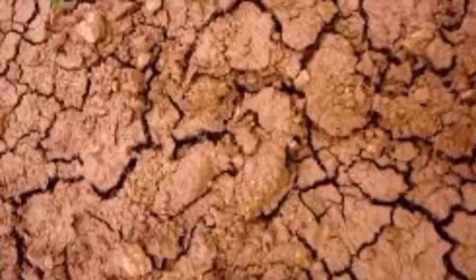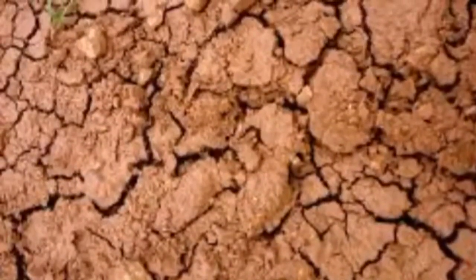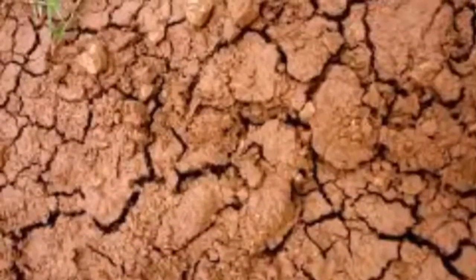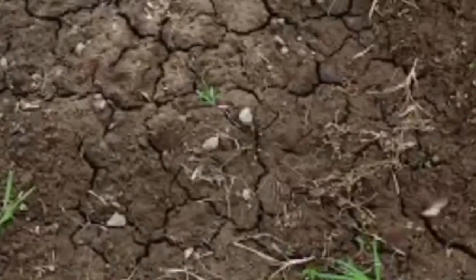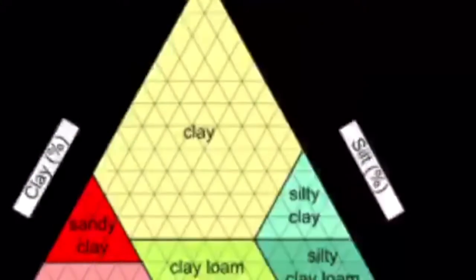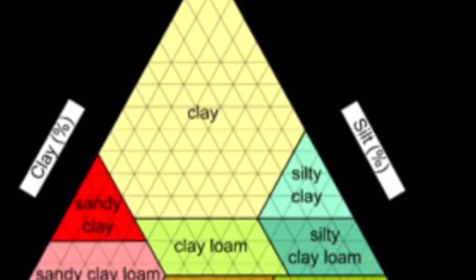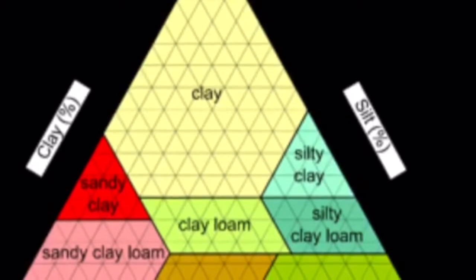The purpose of the soil lab is to determine soil texture and judge cohesive and adhesive soil properties, capillary action, water holding capacity, and determine wet and dry permeability of soil. The hypothesis my group and I had come up with before we had started the lab was, if we compare the results of the soil texture test to the results of the hydraulic test, then the results will not be the same. In talking about the results, we are talking about the soil.